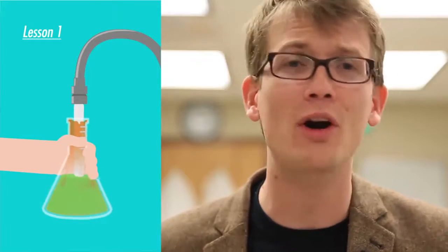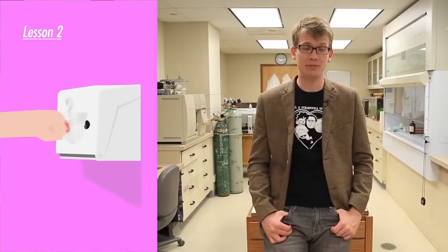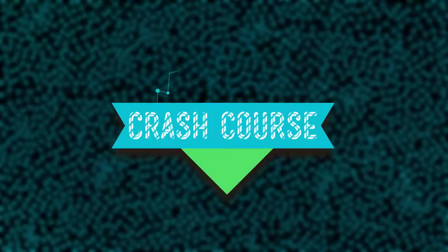Today, we're going to talk about how to avoid injury in the lab and some good techniques for using laboratory equipment correctly. First 2 lessons already learned: never wash out a vial you aren't familiar with, and don't punch paper towel dispensers.